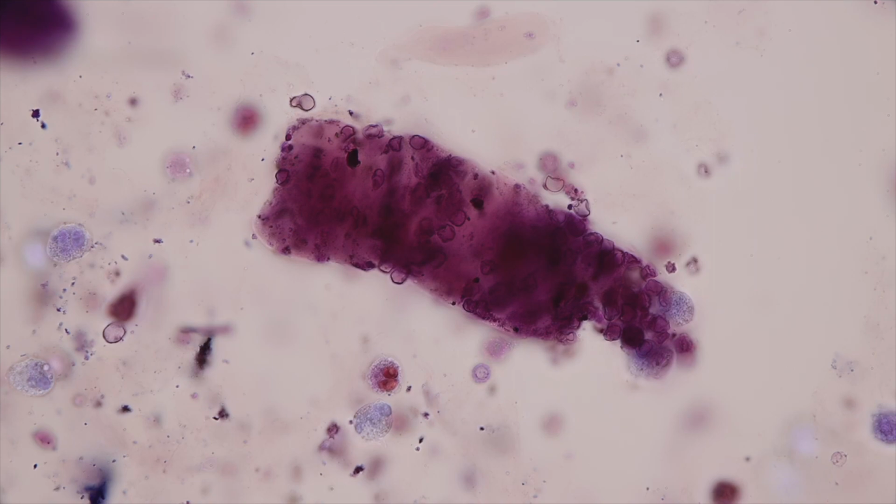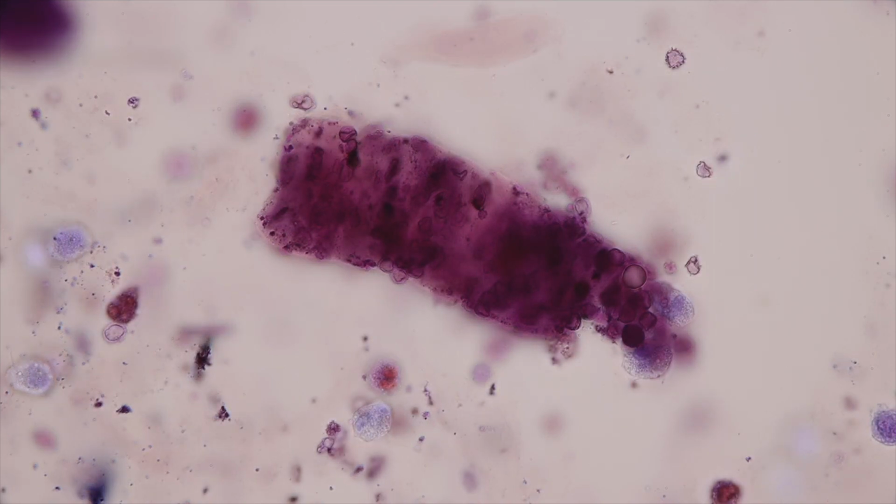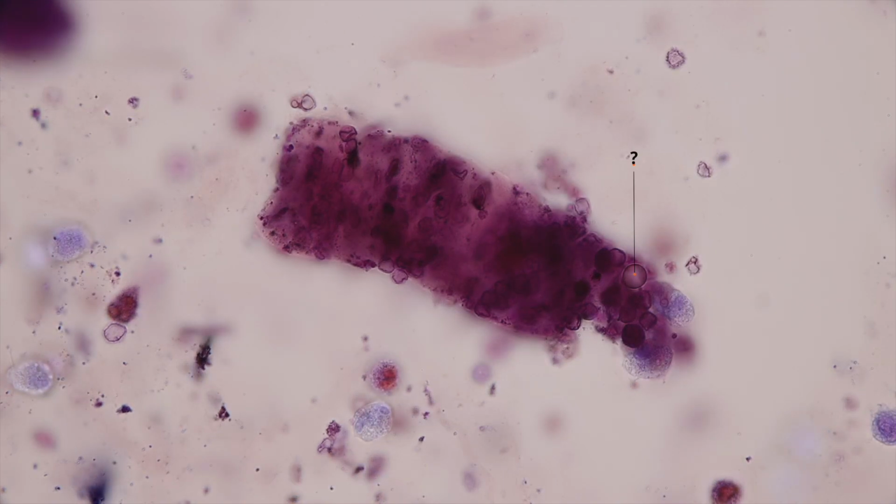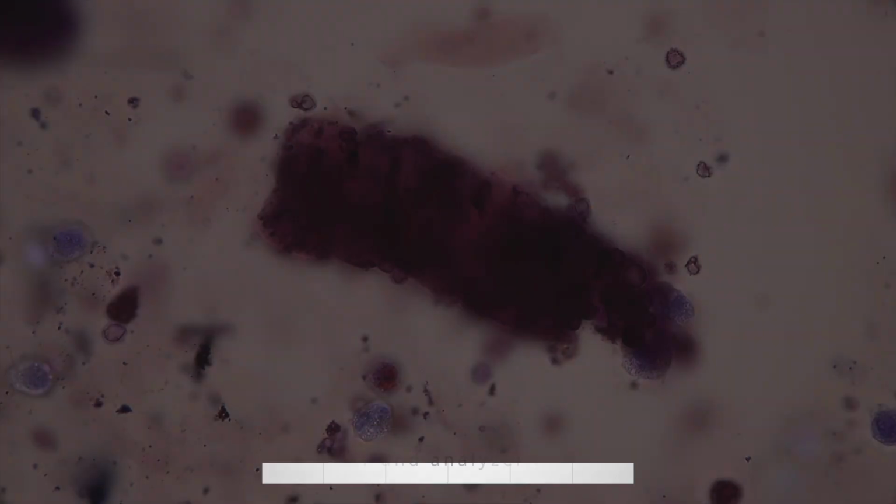Then as we look closer within the cast, focusing up and down, we can see that these are mostly red blood cells. But there's one structure on the right that looks like a red blood cell, but it's a little different color, it's a little larger. Can't quite tell what this is. So we'll insert the polarizer and the analyzer and see if this gives us a clue.